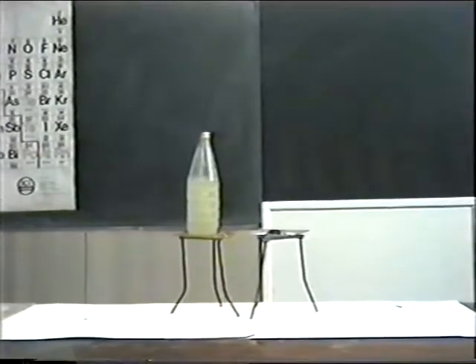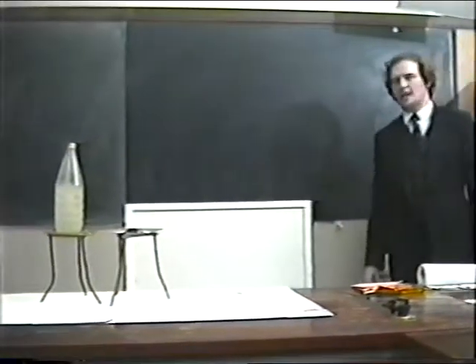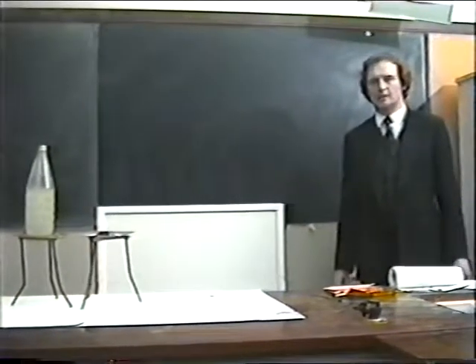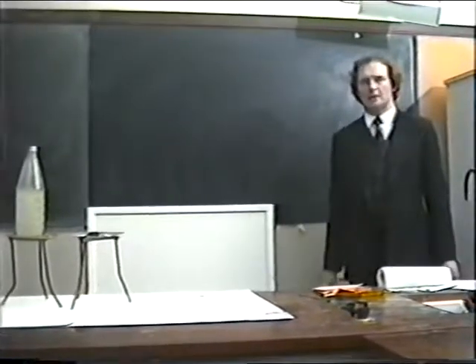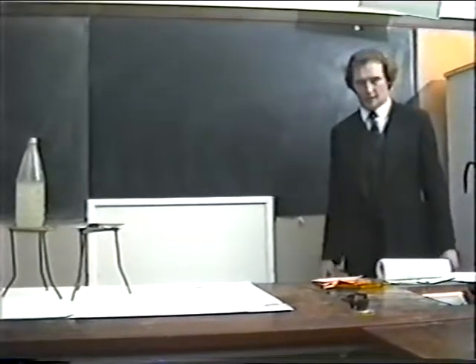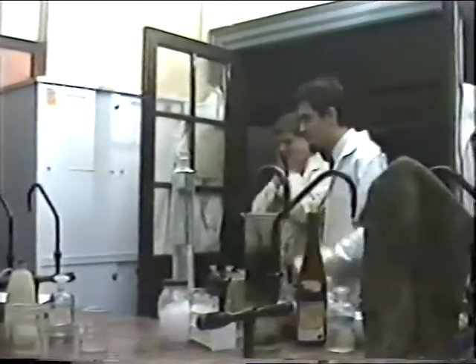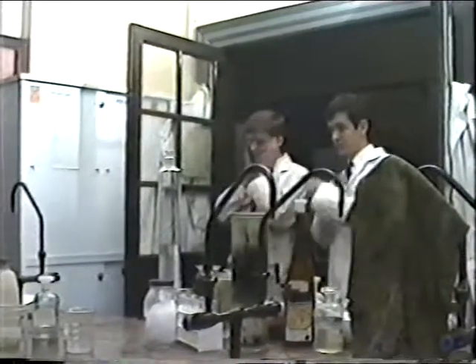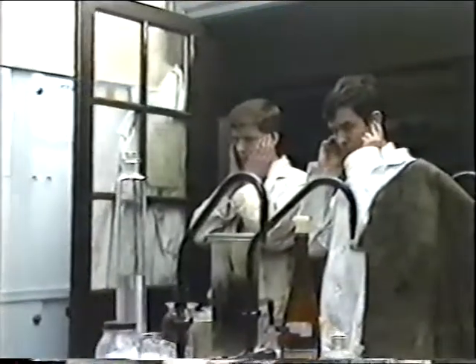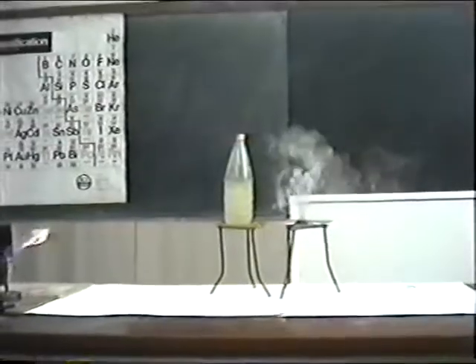Just before the explosion, as my final word, can I just make one word of advice? On no account should you ever attempt experiments of this nature unaccompanied by qualified adults or in a laboratory by yourselves. These experiments can be extremely dangerous if they are done in the absence of qualified supervision. The fuse powder is now beginning to warm up, and we shall shortly observe an extremely bright flash, and it will be immediately followed by a very loud bang indeed.